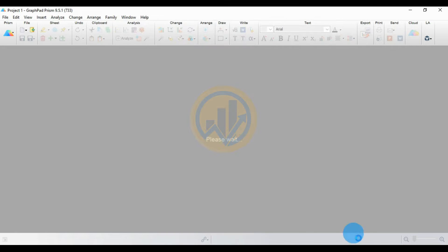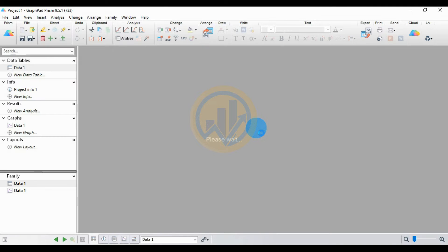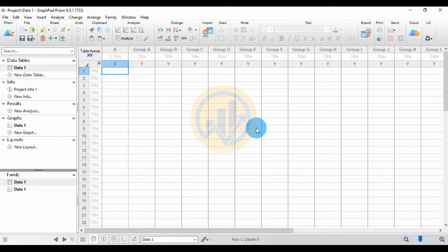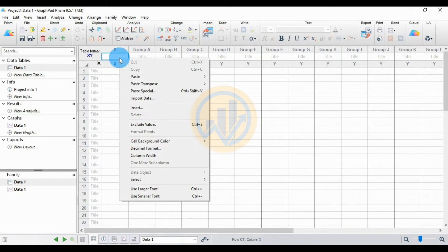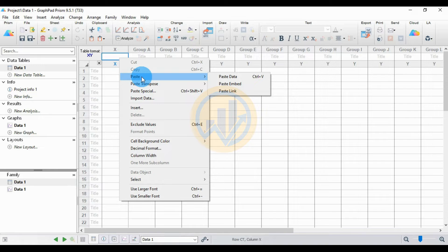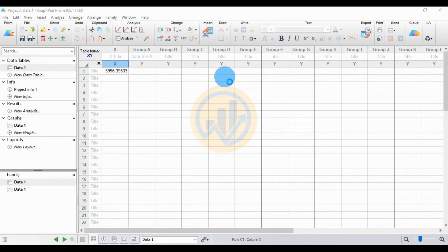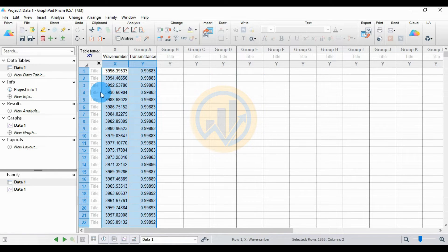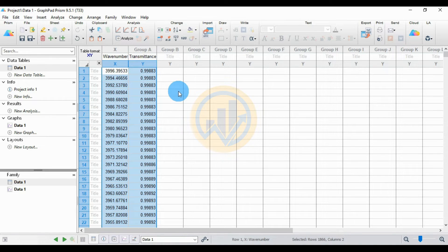Click the 'Create' button, then open the worksheet in GraphPad Prism. Select the X title column and paste the data using the right-click menu and selecting paste. The X column is for wave number and the Y column is for transmittance.